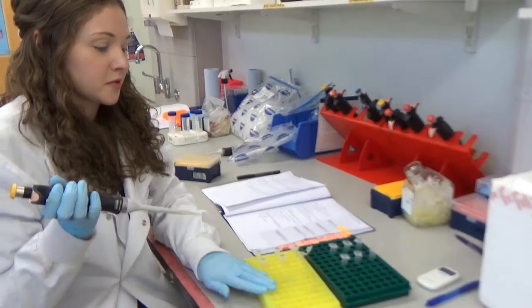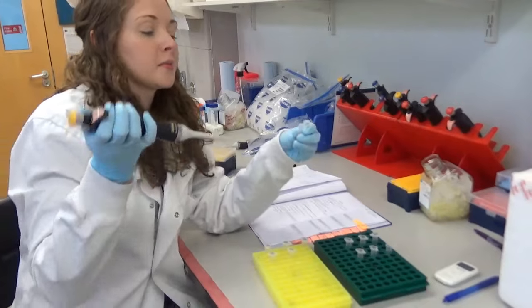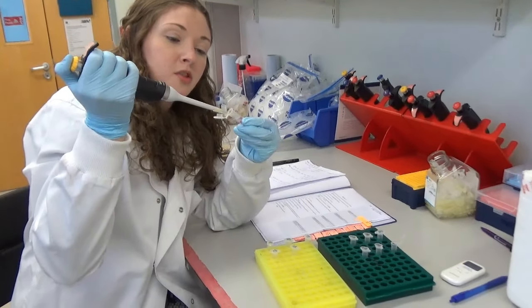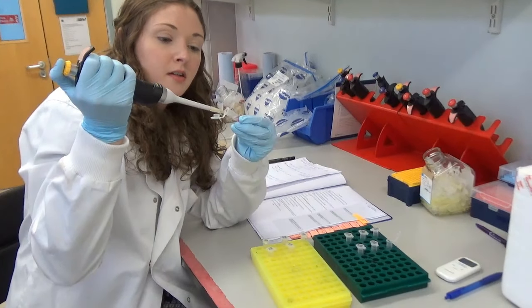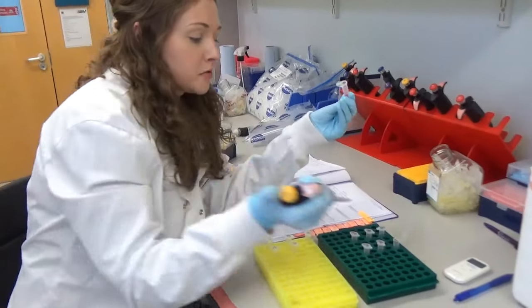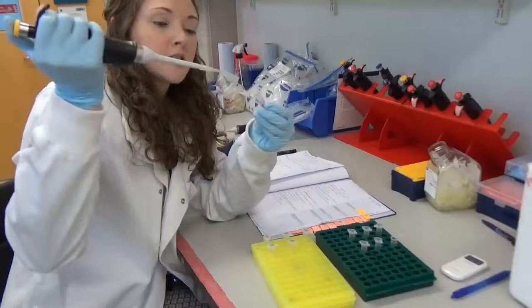Basically what we're trying to do is sort of an artificial model of what happens in a diabetic kidney. So essentially if we find out something that these cells do in response to high glucose or high inflammatory mediators, that could potentially inform new treatments in the future, and just gives us a better idea generally of what goes on.